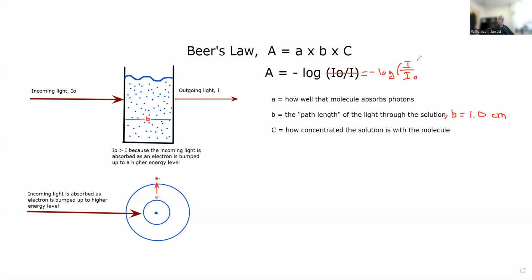That's what I get for typing wrong, but I'm not going to restart this whole video all over again. So let's pretend you never saw that. And so this will always be a ratio smaller than 1. The ratio I to I naught will always be a ratio smaller than 1. That's how we would measure the absorption.